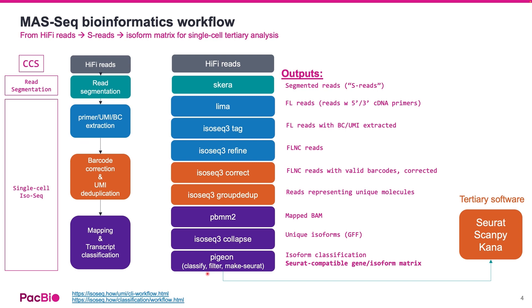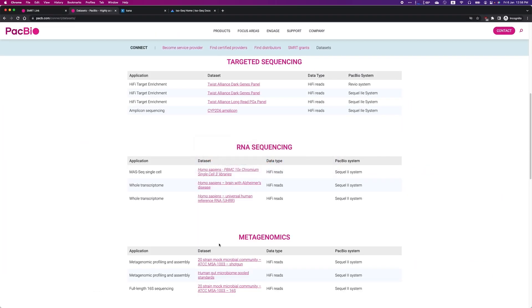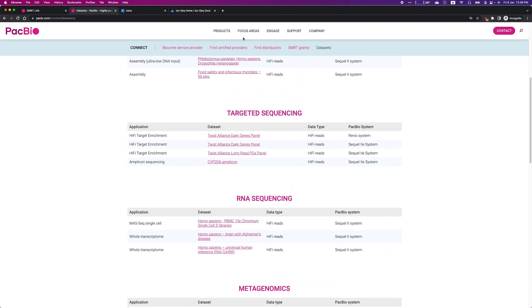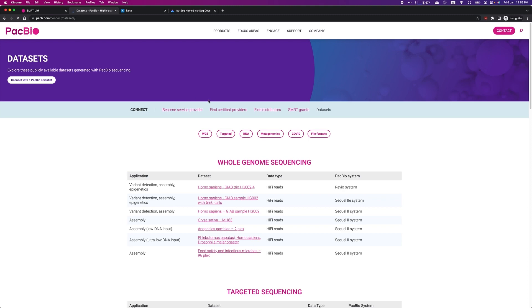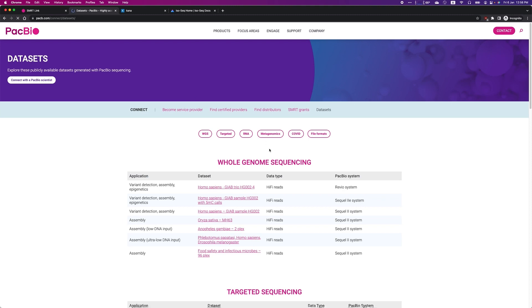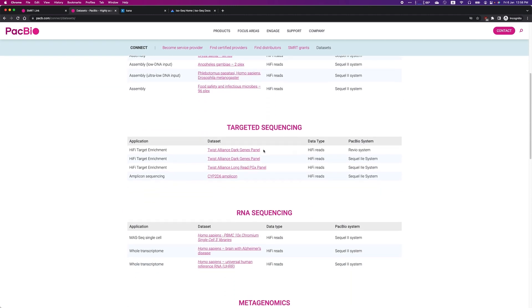Let us now take you through step-by-step to analyze a demo dataset available on PacBio website. If you go to our official website, under Engage, Access Datasets, you can scroll down and find under the RNA sequencing section, a set of human PBMC single cell dataset sequenced with the MAS-Seq kit.